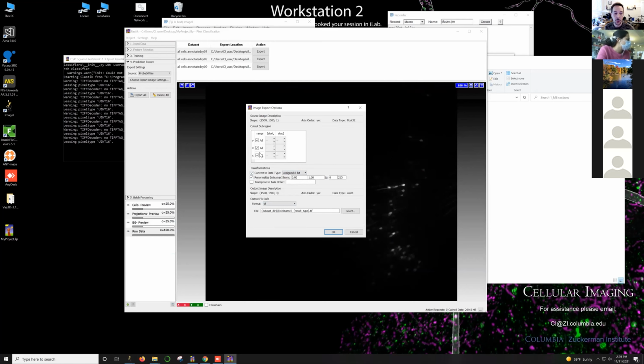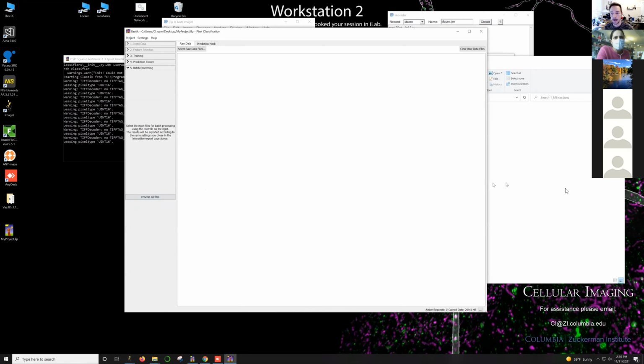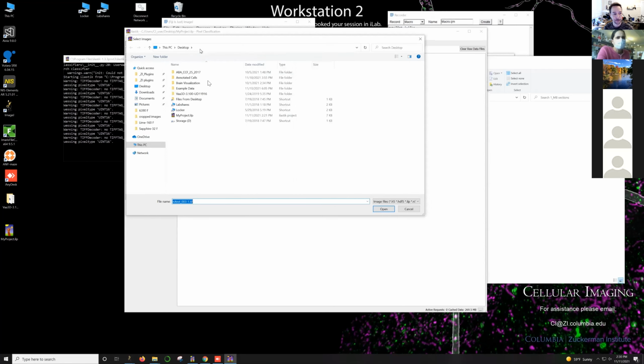If you only care about the cells and the projections and you don't need the background, or maybe you only care about the cells, you can tell it here you don't want every channel. We just want channels 1 and 2. That's the cells and the projections, or 1 would just be the cells. Okay. So that's it. We've trained this project. We could save it. And if you wanted to process several images from within Ilastik, we can just go to batch processing here and select some data.